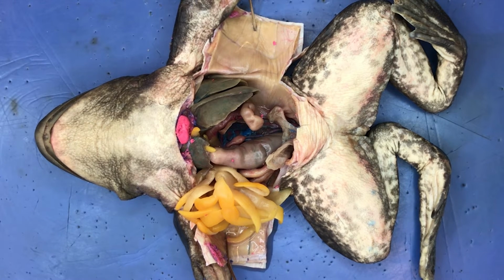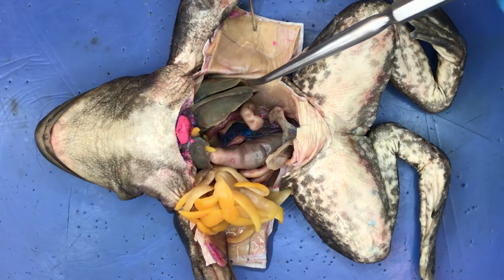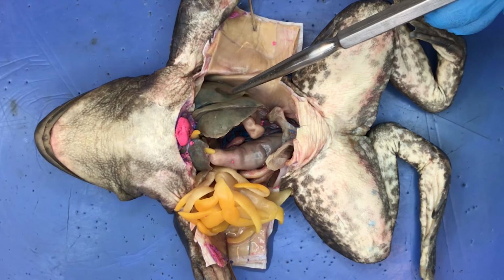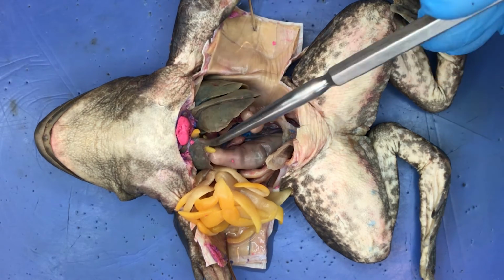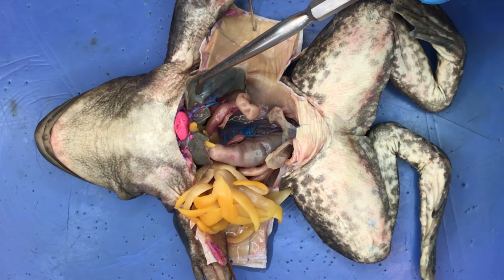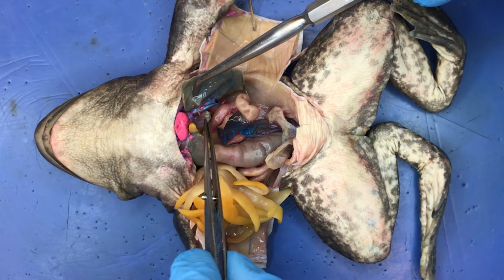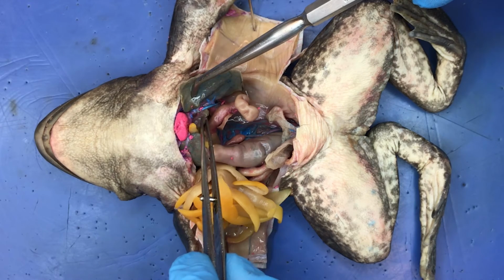Now that we have exposed the abdominal cavity, we will explore the organs within. First, note the prominent lobed liver, which is the largest organ of the body. Just dorsal to the right lobe of the liver, we can see a thin-walled gallbladder embedded on its lower surface.